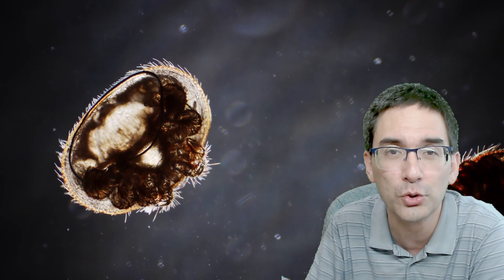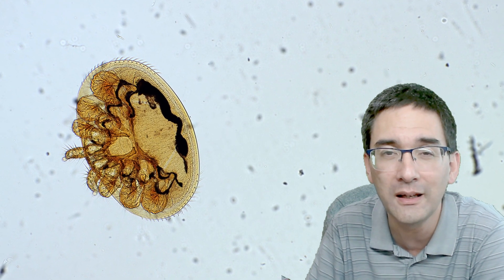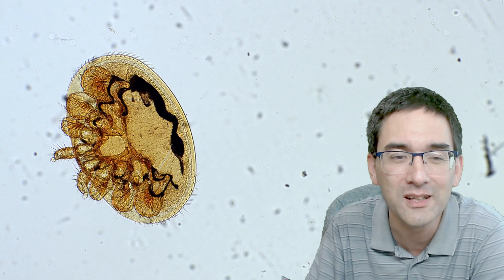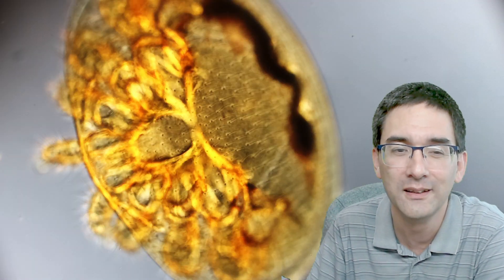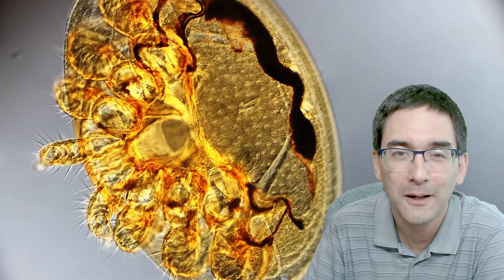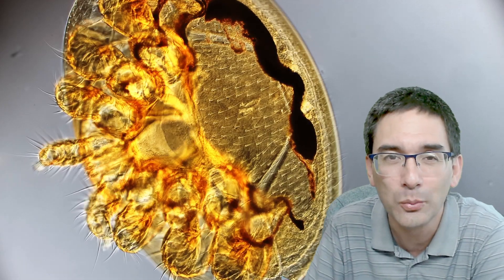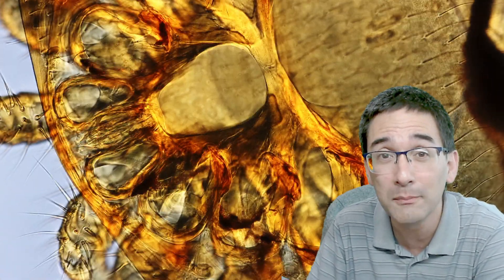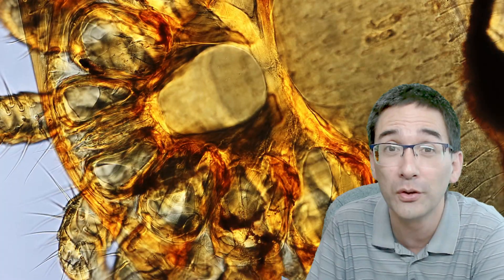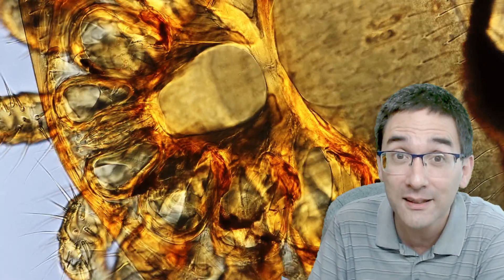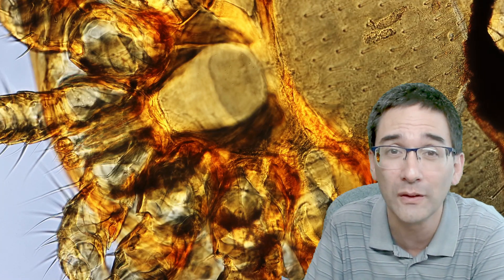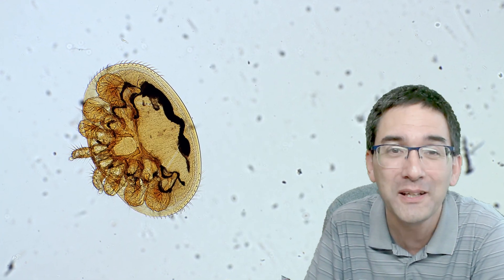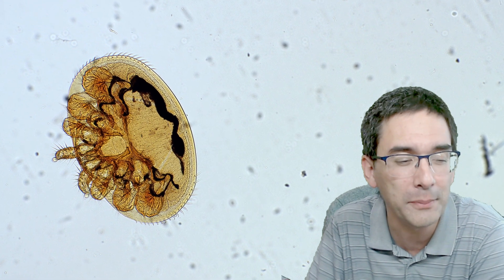For comparison, I wanted to show you a commercial slide of the mite. This is how a commercially prepared slide looks like - they've bleached it. You see it's much more transparent, better in contrast, looks much better. What I'm going to do in the upcoming days and weeks is experiment around a little bit by preparing them in such a way that they become lighter. Lactic acid is also able to bleach them. I'll be experimenting around and then make another video.